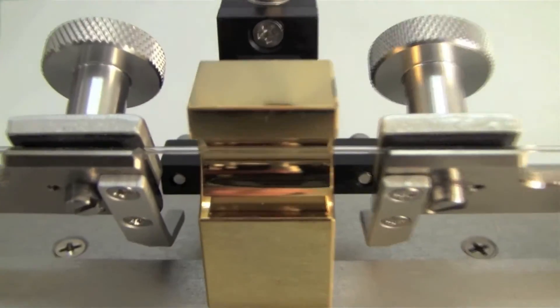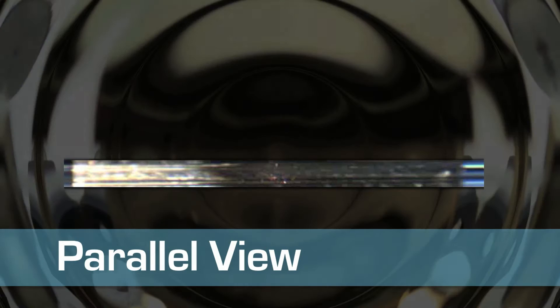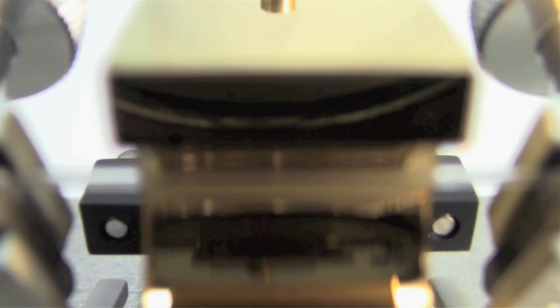In another point of view we use in our videos, the camera is positioned directly behind the retromirror, just above the axis of the laser beam. This is referred to as the parallel view. Most of the time in parallel view we will have the lights dim. This gives us a higher quality image of the heat distribution within the quartz capillary.